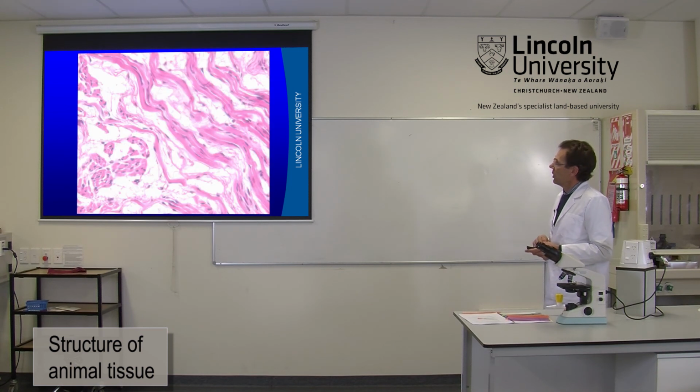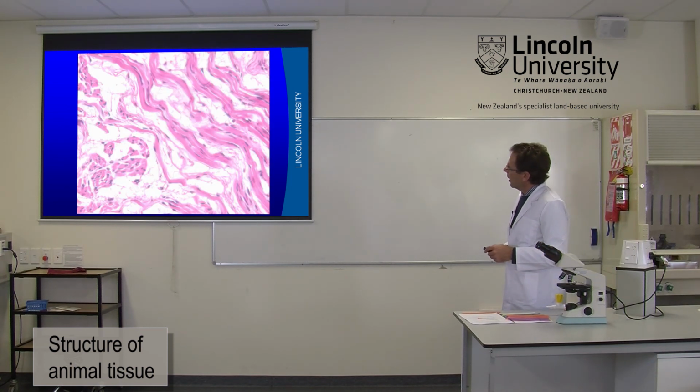If we go to the next magnification, the individual cylinders now start to become more apparent. So here we've got maybe 4 muscle fibres together in a little bundle, 4 here as well, single one here. This thin lacy material between the fibres is that connective tissue.